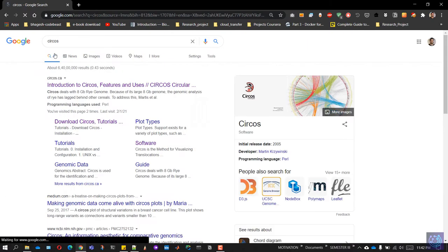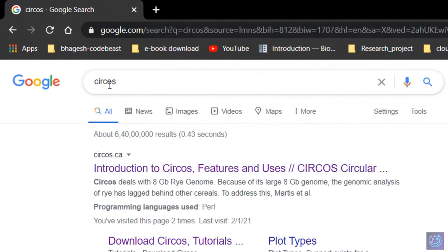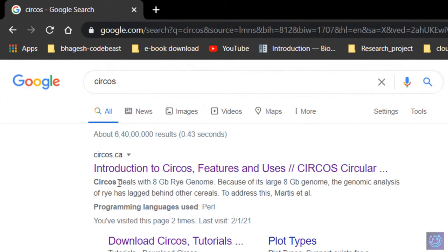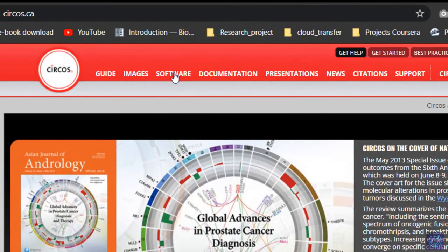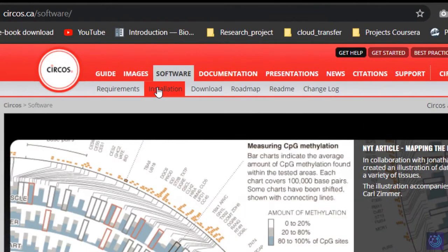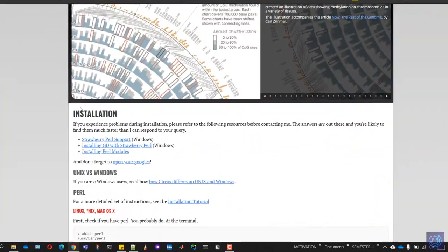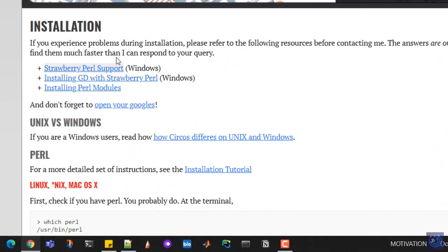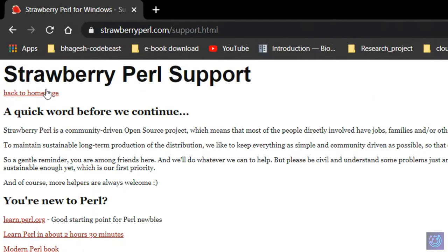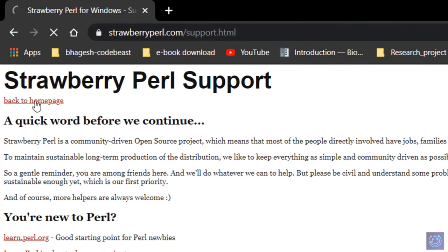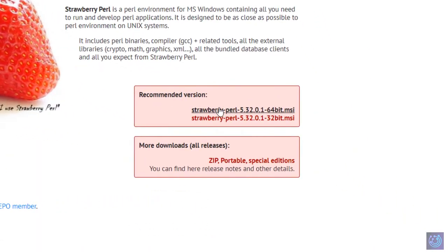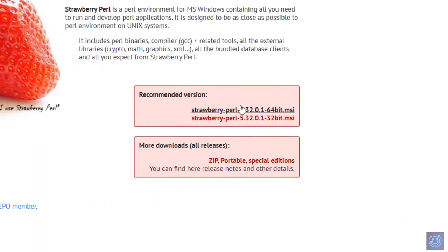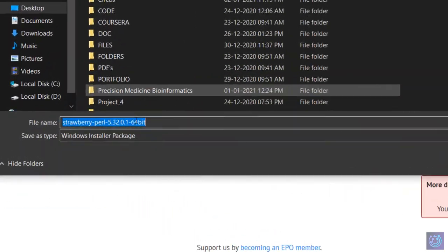First, fire up your browser and type in Circos. Select the first result. From here, navigate to software and select installation. The first thing we need to download is the Perl distribution for Windows, that is Strawberry Perl. Click on this link, then back to home page, and select the first link to download. This will be a Windows installer package. Double-click on it once downloaded and it will get installed.